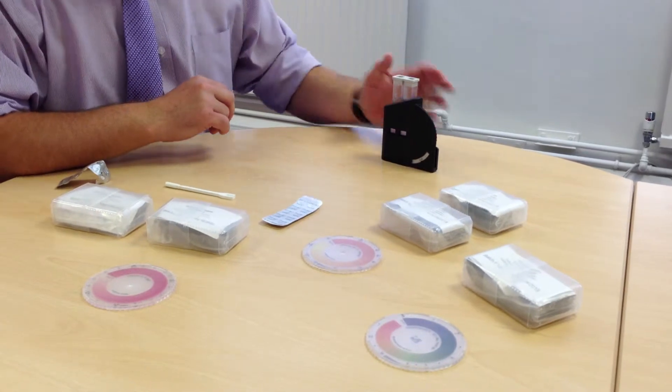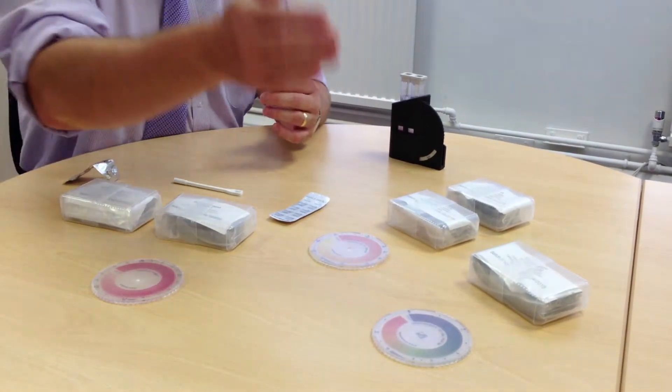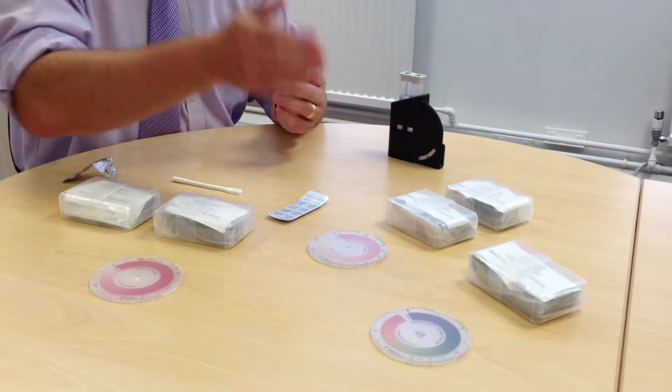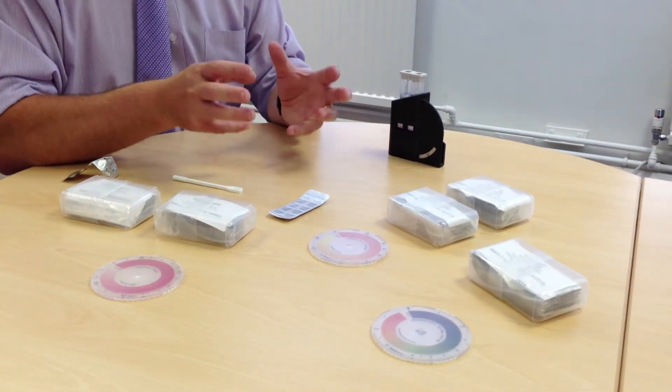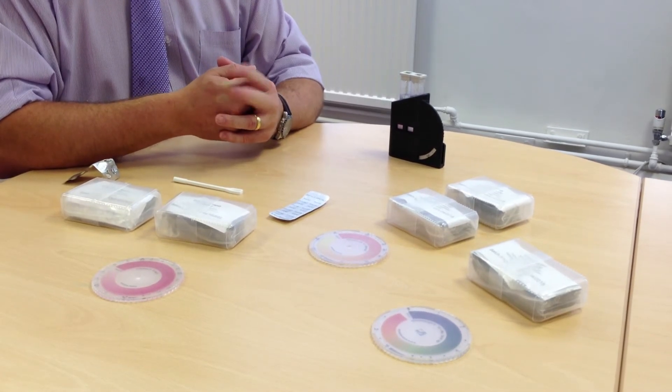This would be the same principle for other comparator methods, whether you are testing pH or the high range chlorine. All the discs are graduated and will require the addition of either one tablet or two.